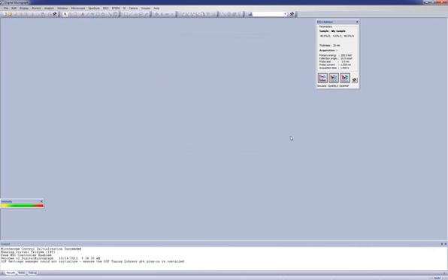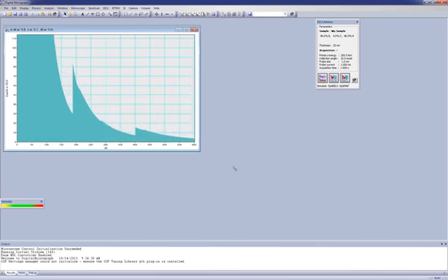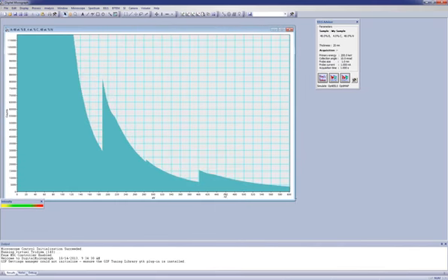So once we've set up the sample and we set up the acquisition conditions, we can go back to the EELS Advisor palette and go to the button at the bottom suggesting simulate and hit that simulate button. And this generates a spectrum here that shows the boron in this case at 188, the small amount of carbon, and nitrogen at 401 eV.